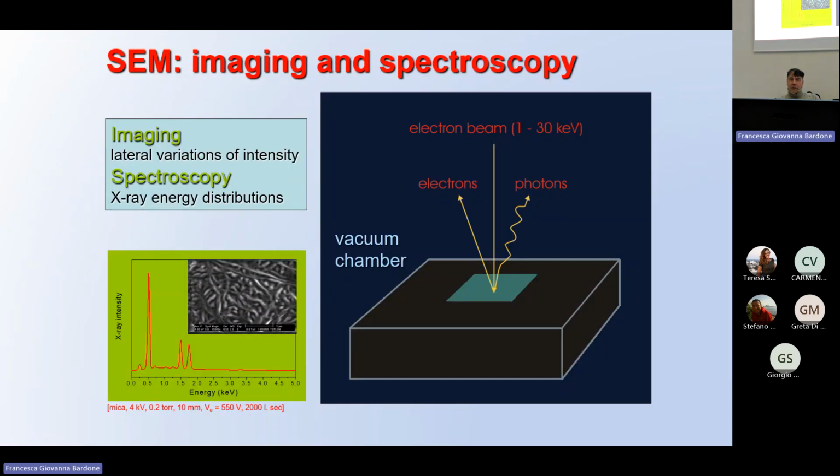Where is it? Here. This is just to show you which type of signals are produced. And my electron beam, now, is fixed in this point. It's always the same point. But in the scanning electron microscope, your electron beam is not fixed in one point. It moves. Starts from a point, then moves along a line, and then makes another line, another line, another line.